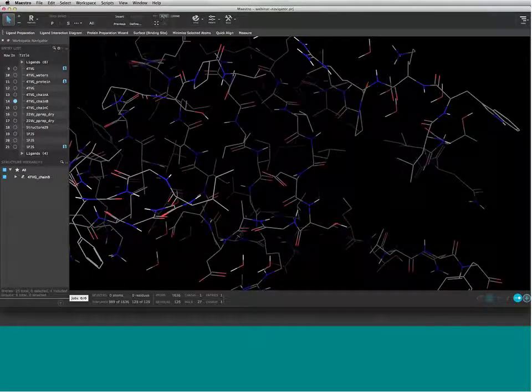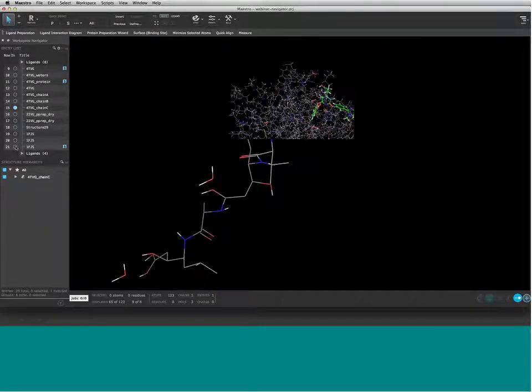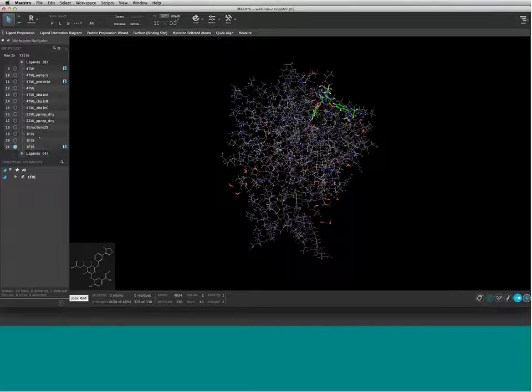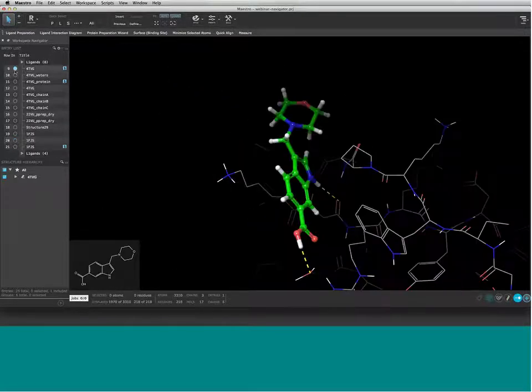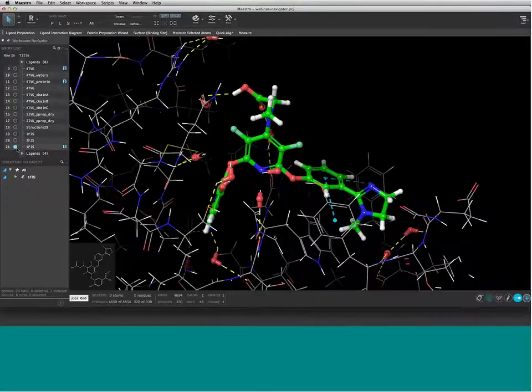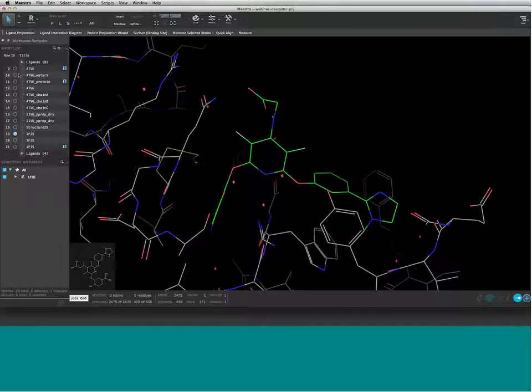If we want to change the view to show all displayed atoms, you turn on the auto button. Once that's on, the ligand button becomes visible. When that's also turned on, not only do you refit the view to the structure, but you refit it just to the ligand. So those disparate structures still work now, because it'll just view a different part of the ligand. That's another way, when viewing docking poses, since you'll probably be looking at the ligand, you can keep auto ligand on. It'll slightly change your view, but it'll always go to whatever ligand is within the structure.